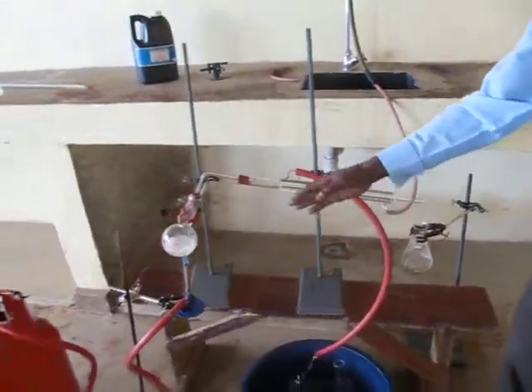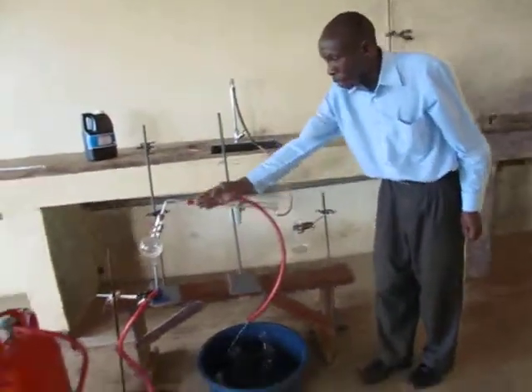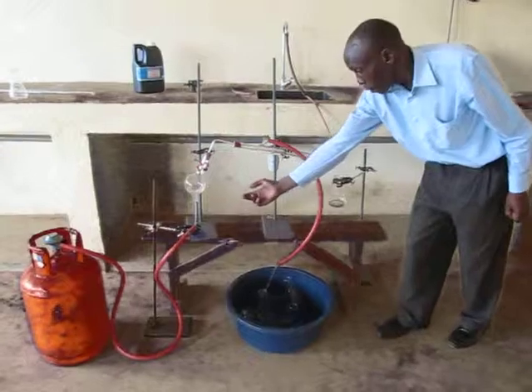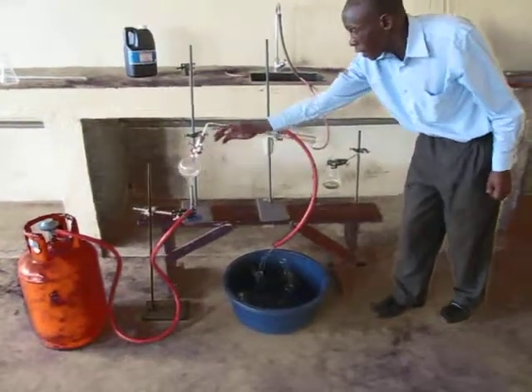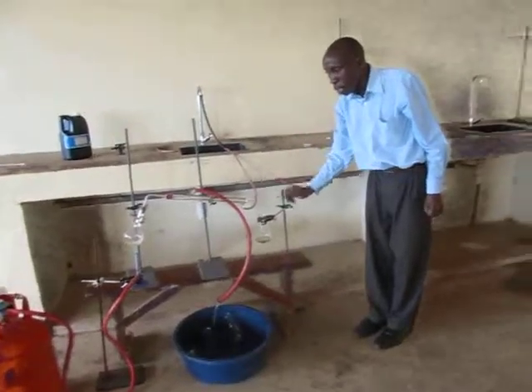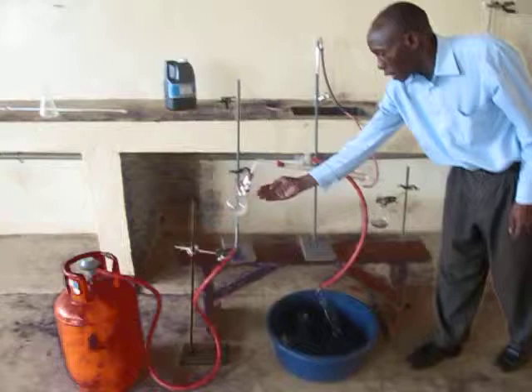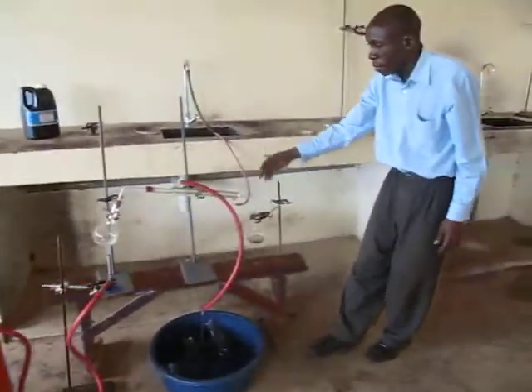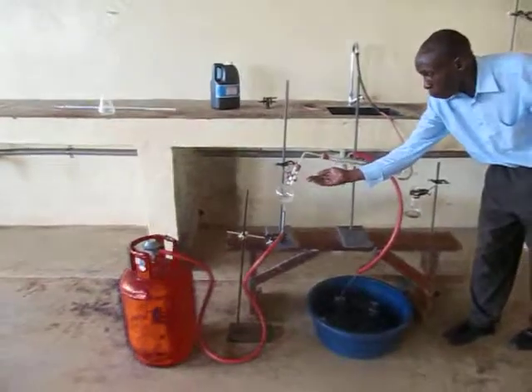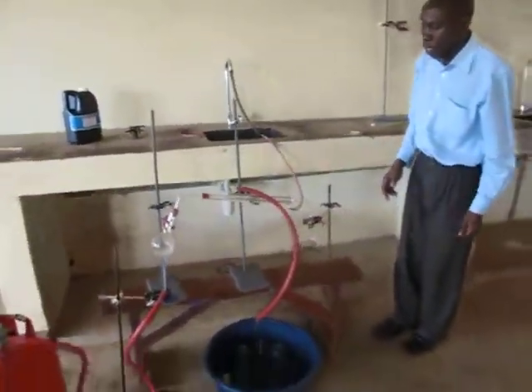At this juncture, when we are getting our first fraction, the temperatures are supposed to remain constant, though heating continues. The temperatures should remain constant until the first fraction is fully collected, and thereafter the temperatures will start rising up to the boiling point of the second fraction, where you now start collecting the second distillate.